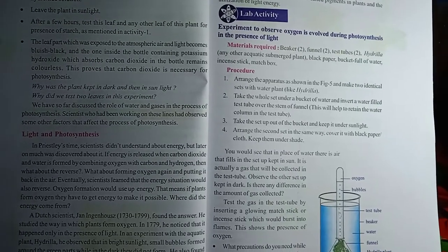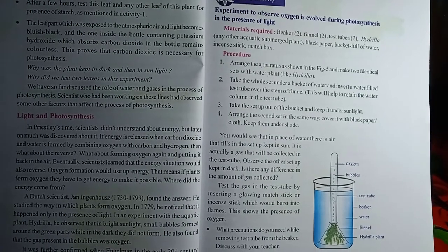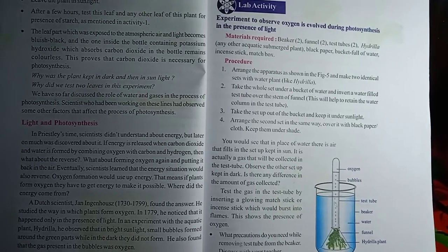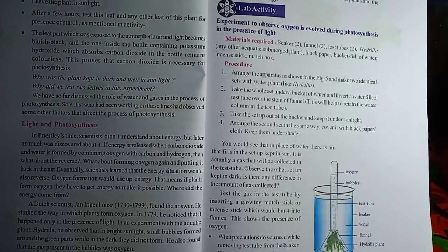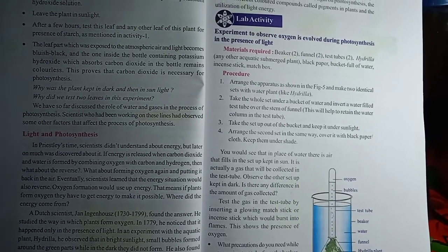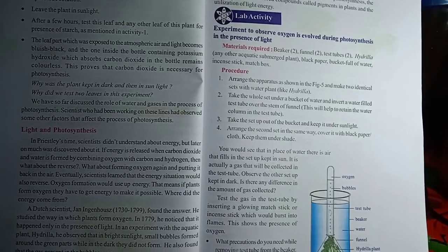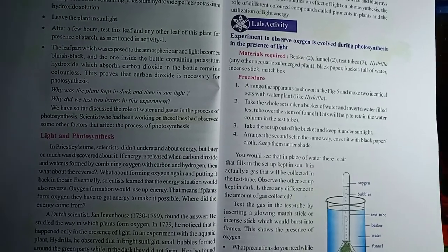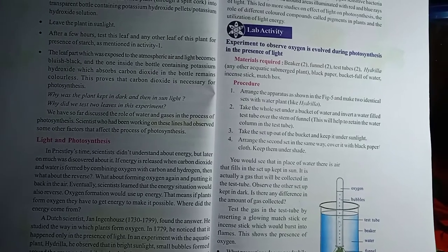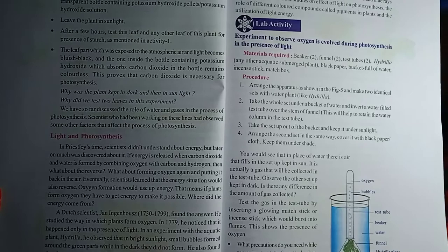Now we need to do an activity — the hydrilla experiment — in our laboratory or classroom. To do this activity we need to follow some steps: number one, aim; number two, material required; number three, precautions; number four, observation; and conclusion or inference. These are the steps we need to follow while doing any activity.